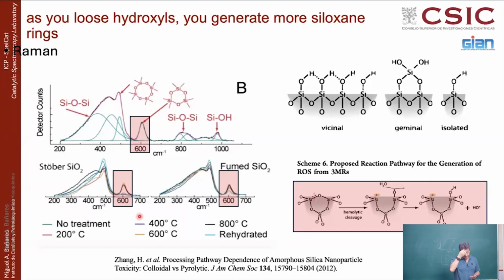Now, what is happening is that this precipitated silica has a good number of silanol groups. We already saw yesterday that with deuterium you can confirm that indeed this is a hydroxyl group. And over there is nothing with hydrogen, because those didn't change with the replacing of hydrogen by deuterium. And these are essentially associated with siloxane groups, silicon, oxygen, silicon rings. Different size, different characteristics. So typically, Raman spectra of silica looks essentially like that.